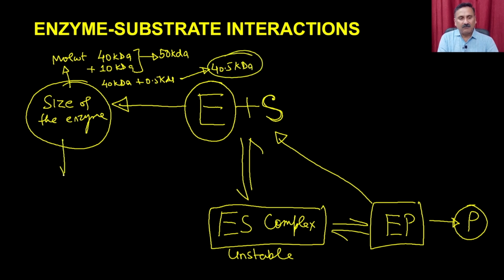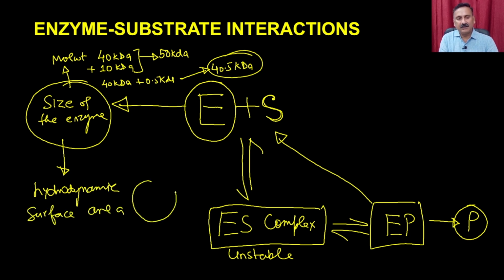Size is also going to change in terms of the hydrodynamic surface area.